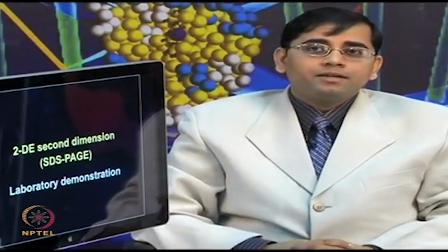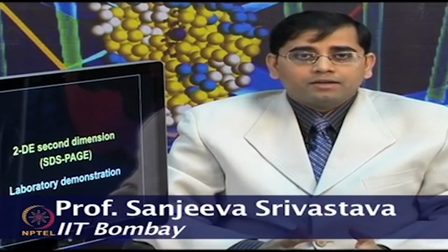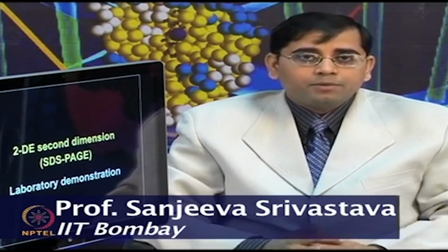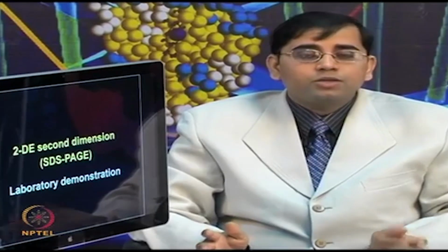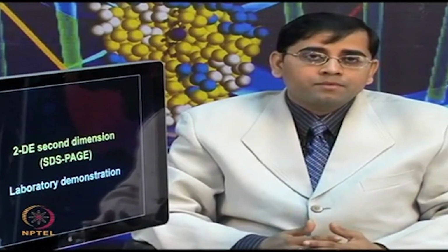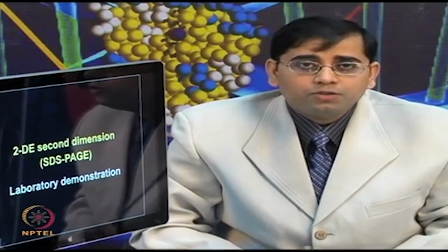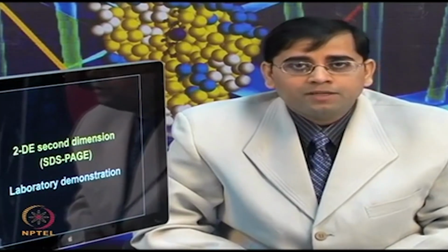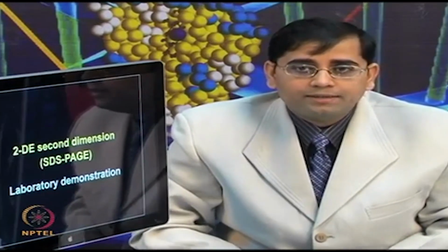So, as I mentioned, you have seen the classical SDS PAGE and blue native PAGE. The concept is similar and it can be applied in the two-dimensional electrophoresis. There is little variation here, because now you do not need to add a comb. You have to have a flat comb for making a well to add your IPG strip, and you do not need to add the separation for stacking gel. So, in this laboratory demonstration video, I will show you for the two-dimensional electrophoresis how to make the SDS PAGE. So, the equilibration process will be demonstrated, as well as how to run the SDS PAGE for 2DE.